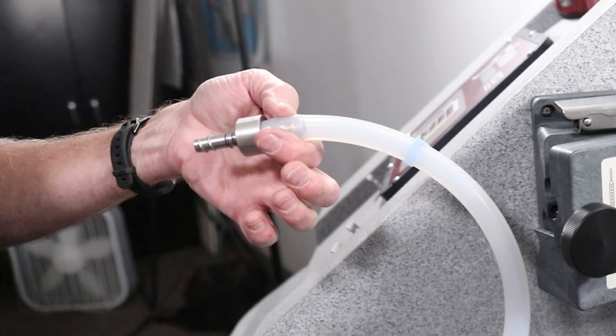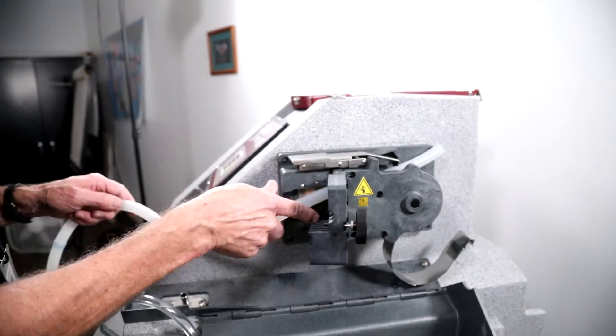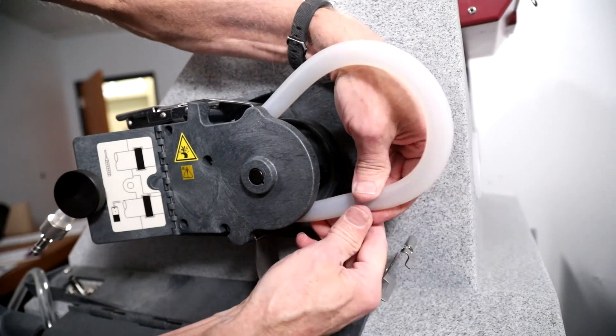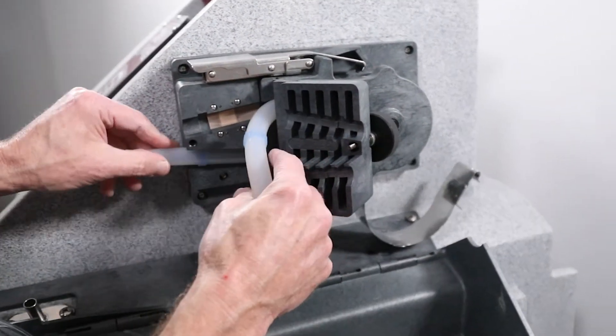Install the tubing coupler into the new pump tubing on the end that is closest to the blue bands. Feed the opposite end of the pump tubing into the top groove of the liquid detector and above the pump rollers. Continue to feed the pump tubing through the bottom of the pump and exit through the bottom groove of the liquid detector.